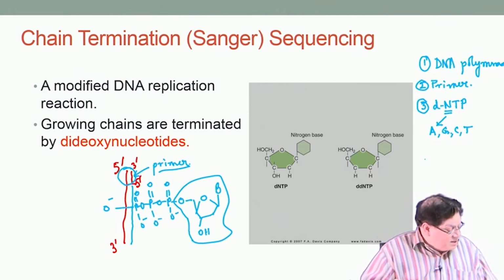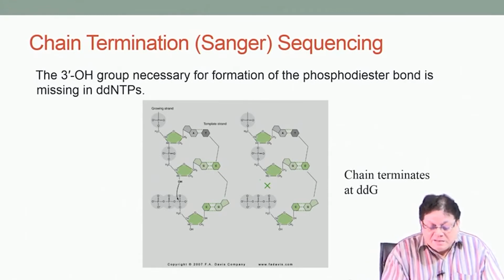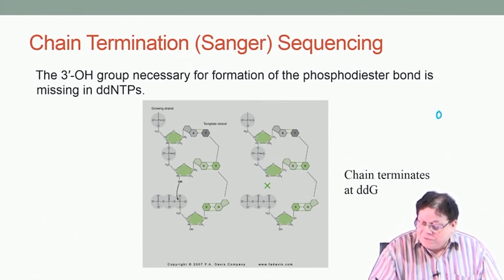Because during the synthesis of the chain, what happens is that actually it is written here, but I can explain that you have a nucleoside triphosphate.